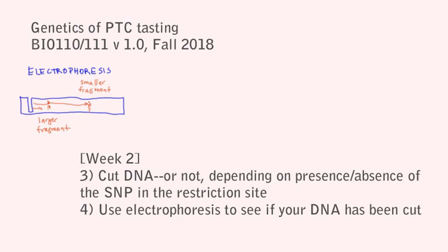Oh yeah, I forgot to tell you that the gel is actually below the surface of the electrophoresis buffer that's there in the gel rig. Now when you load the well, the one mistake you want to avoid is shooting the sample out of the pipetter with any force, because that will just blast out whatever is there in the well. Big mess.